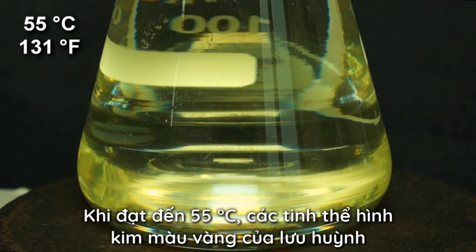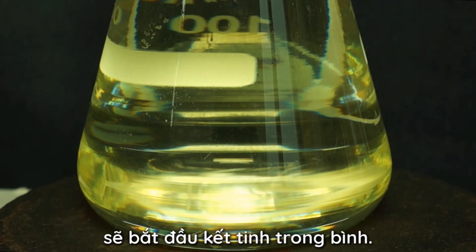Upon reaching 55 degrees Celsius, yellow needle crystals of sulfur will begin to precipitate in the flask.